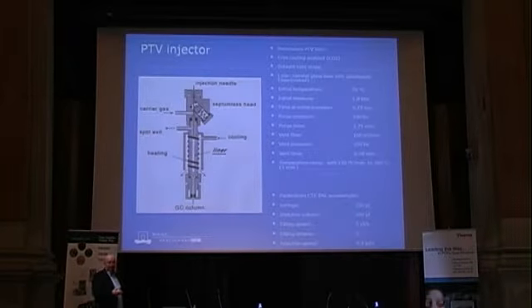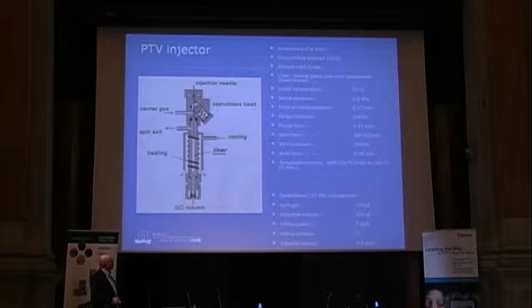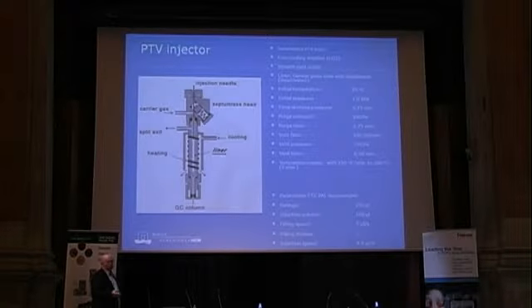In the past we did the same, but after we went back to half a milliliter, we had to additionally concentrate the sample down to 10 microliters, and then we injected 2 microliters. So we inject the same amount of matrix, but we inject only from a bigger starting volume. It saves a lot of time, and it really improves the recovery. Is it difficult? No. You have to work on it, of course, and troubleshooting is very important because sometimes you have a peak shape which is not very nice, but then you have to adjust some of the parameters, and quite a lot of parameters are important. Also, the liner is of importance. You need, of course, a deactivated liner. But it really helps to overcome an additional evaporation step.